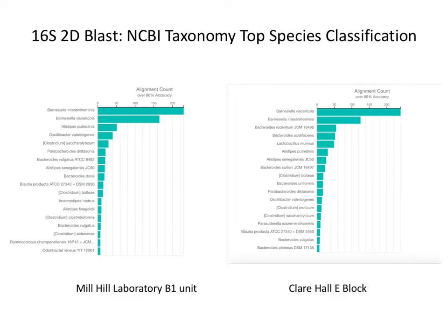So if you were doing a longer read length, you would have to break it up. So there is no alignment. There's an alignment, but there is no, what's it called? When you put contigs together, you're only looking at one smaller bit. But actually people are doing it where they don't just do V3 and V4, they do several PCRs and dump them all into one pot. But the bigger the regions that you do, the fewer samples you can dump in, because you've only got so many reads to play with. So you could do 384 samples maybe with this 16S. If you want to do all the 1500, you might have to reduce that by some amount.